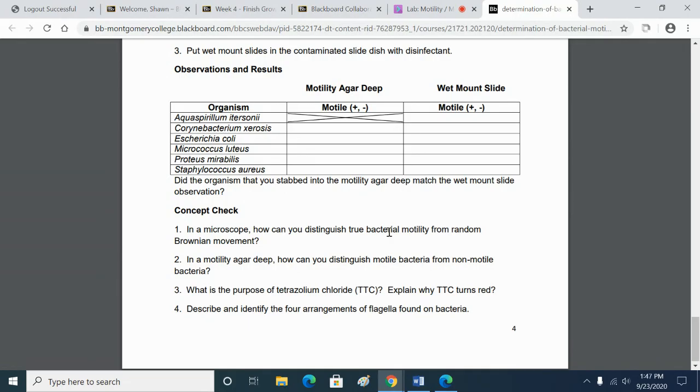What kinds of things might you see the bacteria doing? It might be like bending or twisting. Right, so bending, twisting, twirling, spinning, actually swimming laterally, something like that, right? Maybe moving into and out of focus. So there are things that they can do besides just randomly vibrate.